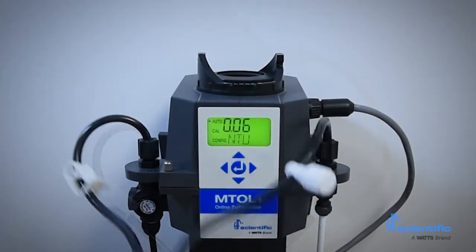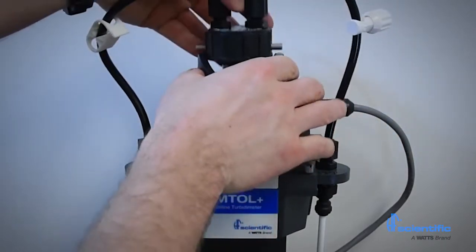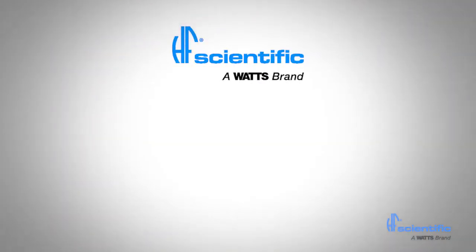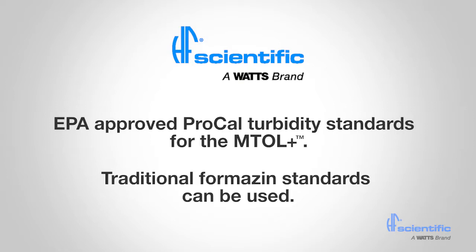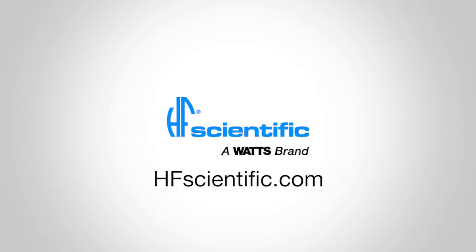The MTOL Plus only stores successful calibrations. If a calibration fails, the instrument will use the last valid calibration. HF Scientific manufactures EPA approved Pro-Cal turbidity standards specifically for the MTOL Plus. Traditional formers and standards can be used if desired. For more information about the MTOL Plus and other HF Scientific instrumentation, visit our website or contact your HF Scientific representative.